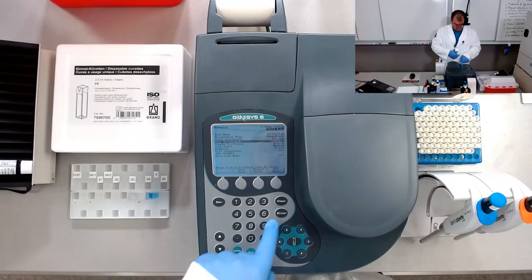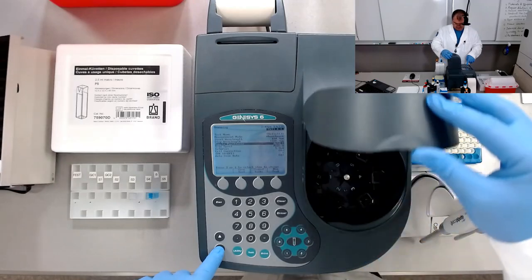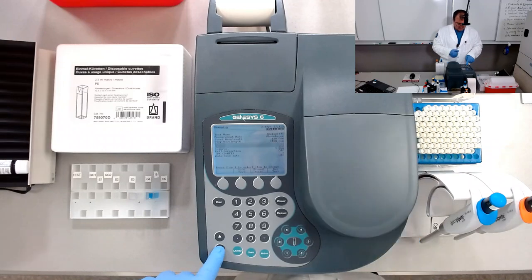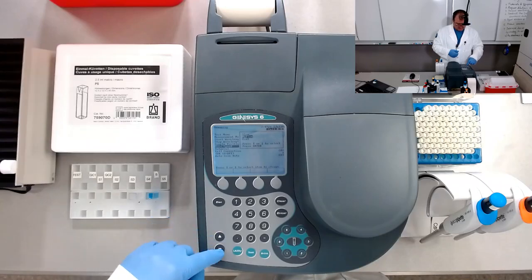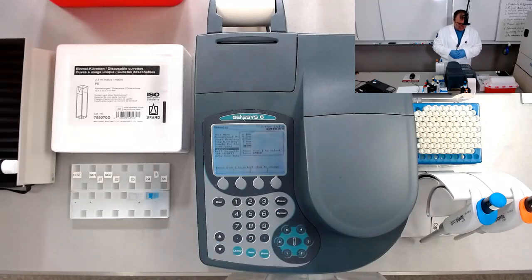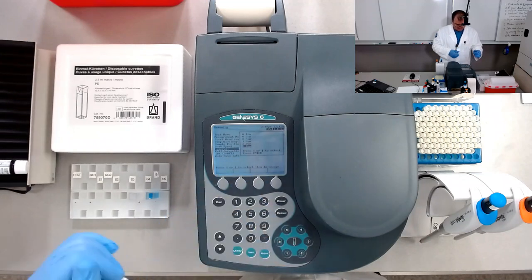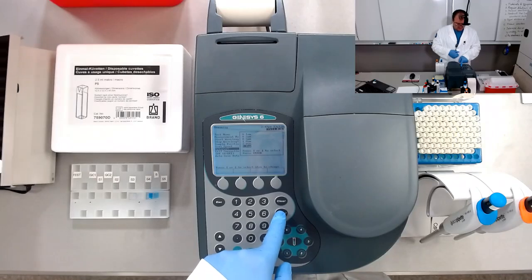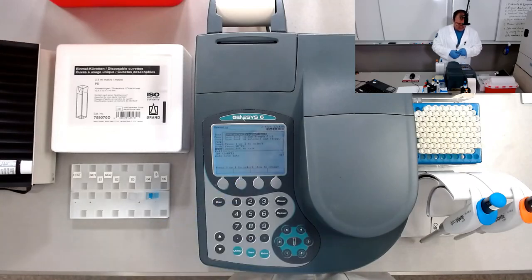That's very good. Okay, so we go down, sample position auto 6. We have a carousel of 6 positions, 5 for samples, 1 for blank. For scan speed, let's go in a faster mode, let's say fast. For interval, we'll take the absorbance measurements using 5 nanometers in between. So a step of 5 nanometers will be sufficient for our procedure here. Okay, so save test.